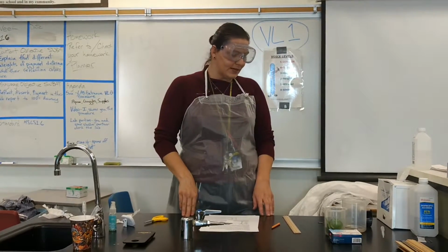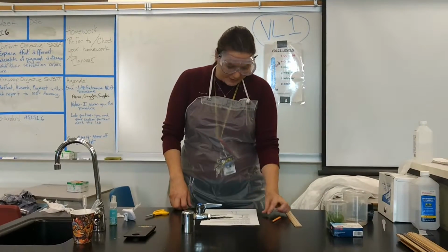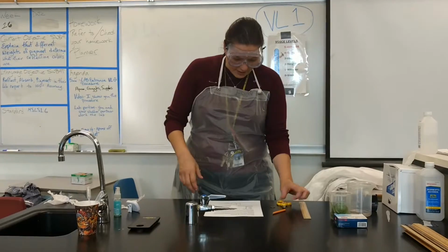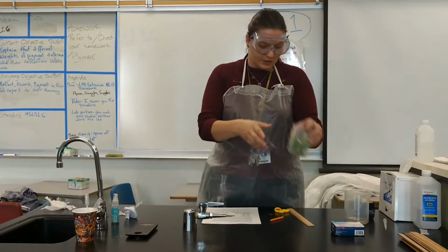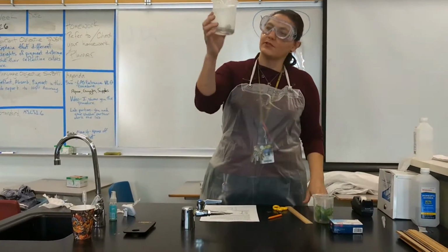Let's see, what else do I need? What's next on the list? A penny or dime. I have a penny supplied by the teacher, of course. I have my scissors here. I have a ruler. I have fresh spinach, which you'll need to get when you come in. And then I have a container of the solution.